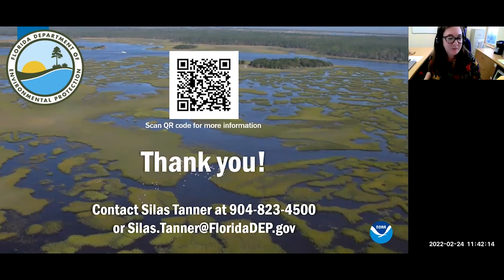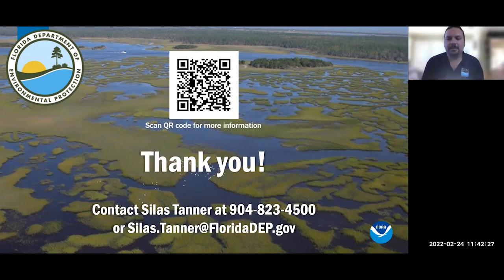What do you think explains the lack of similarity of results across the 12 NERRS? And do you think that there might be another variable that you could use that would be similar? Yeah, so I think some of that variability definitely has to do with the spatial location across the nation. That's one of the great aspects about this project: a lot of times when people look at sensor values versus extracted values, it's just at one location, and that may show a great relationship.